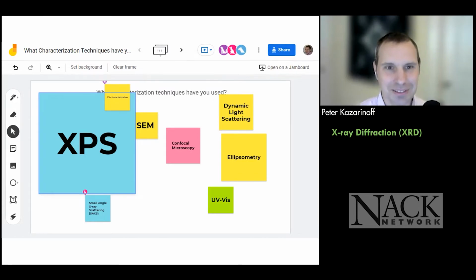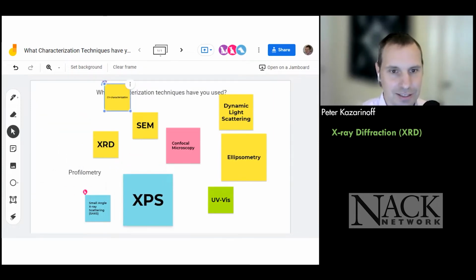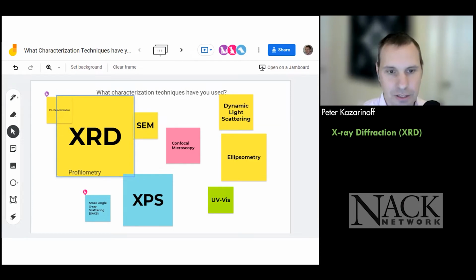Cool. So thanks so much for sharing all those different characterization techniques. And I'm sorry we didn't get a chance to go through all of them, but the one that I want to talk about now is going to be XRD, or X-ray diffraction.